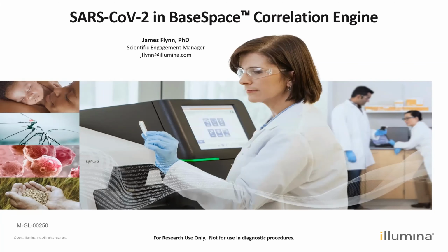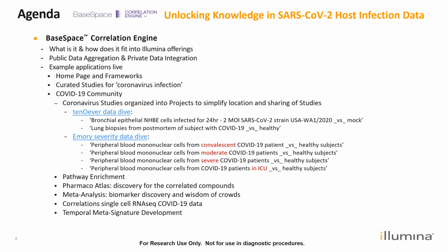Hello, thank you for joining us today as I present an introduction to Illumina's BaseSpace Correlation Engine and invite you to join our efforts in unlocking knowledge in SARS-CoV-2 host infection data. The agenda will begin with several slides to set the stage for what Correlation Engine is, how it fits into Illumina offerings, and where to request free access to the system.